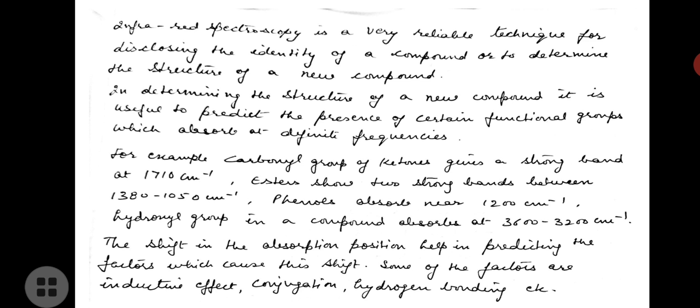Esters show two strong bands between 1380 to 1050 centimeter inverse. Phenols absorb near 1200 centimeter inverse. The hydroxyl group in a compound absorbs at 3600 to 3200 centimeter inverse. We'll be studying this in detail later.